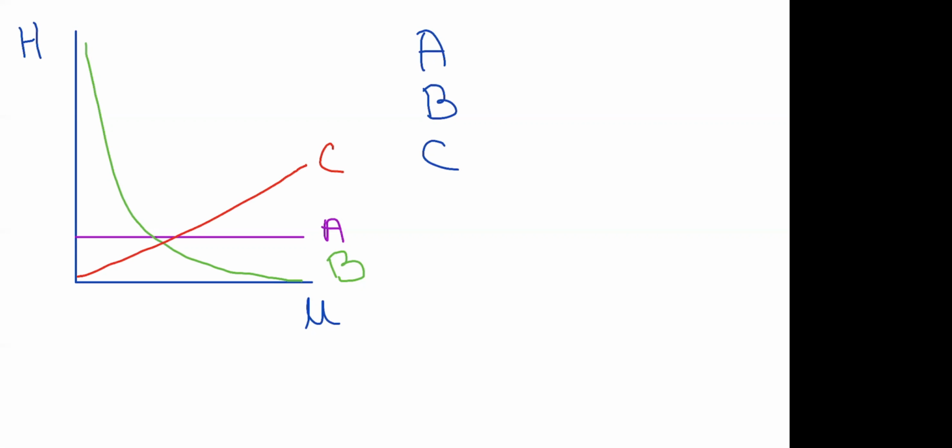And therefore, as a result, the sum dependence of the theoretical plate height versus mobile phase flow rate looks something like this. And this is known as the van Deemter curve.